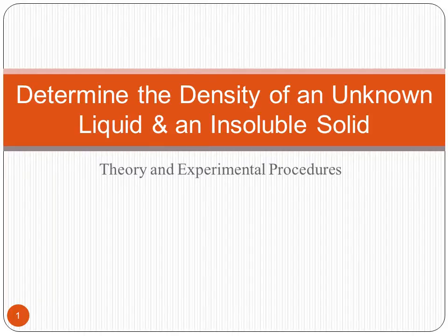Determine the density of an unknown liquid and an insoluble solid. Here, I am going to use this experiment to illustrate how to prepare for an experiment. In other words, I will show you what you need to do before coming to the lab.